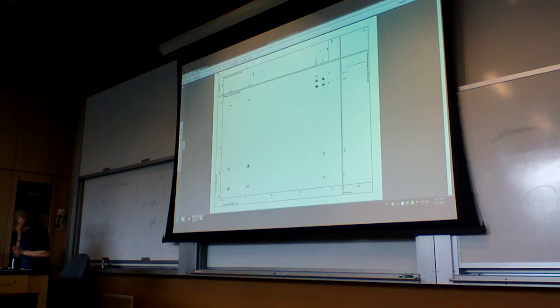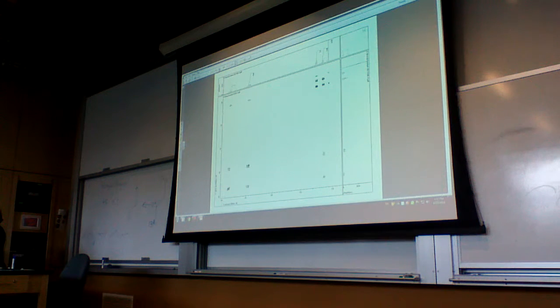So we're looking at 2-hexenol, not 2-hexenol acetate, that was in this number there. So this one is actually the ketone, with an alkene at the end of the chain.